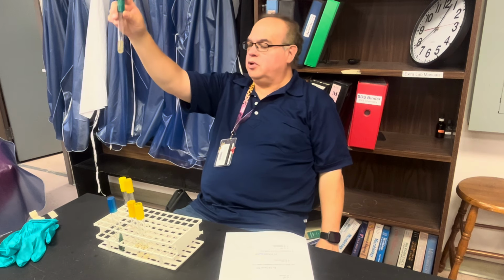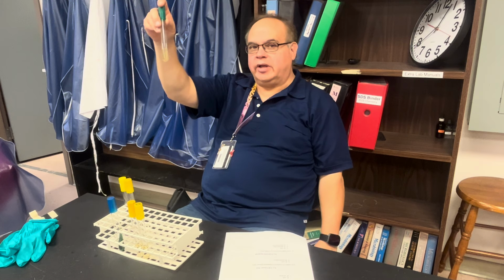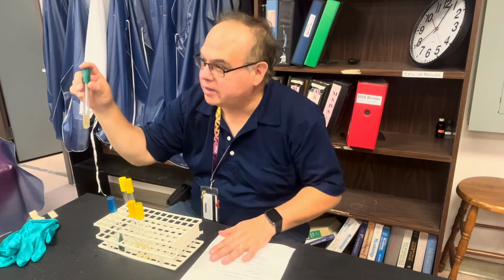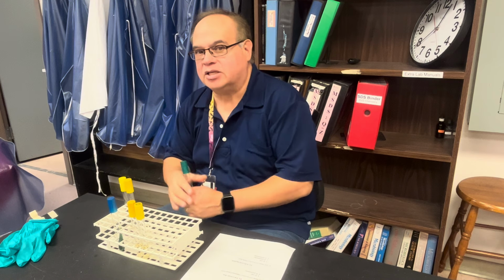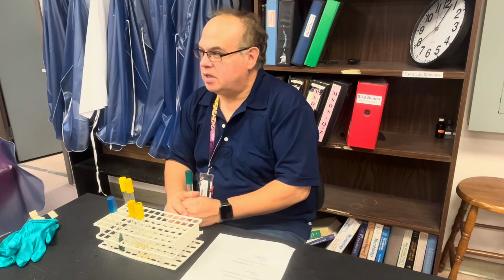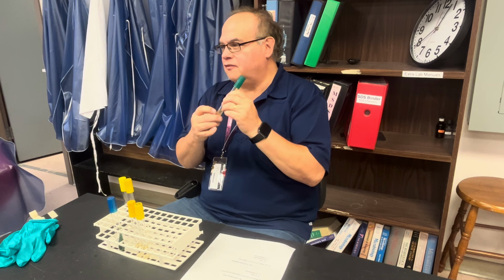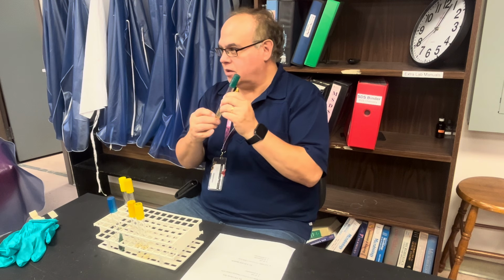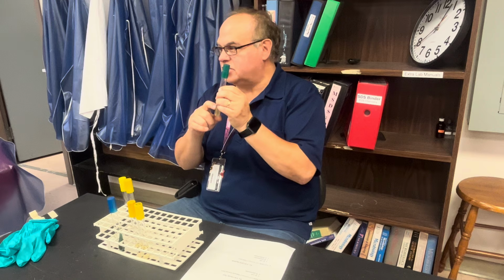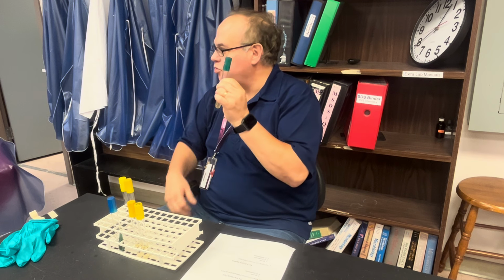There are 3 different substrates in here, 3 different test results that we're going to get. The first one is whether or not hydrogen sulfide gets produced. Hydrogen sulfide is a gas. It gets liberated when proteins are breaking down. And in here, there's a little bit of ferrous ammonium sulfate, also known as iron. That will react if hydrogen sulfide gets produced, and it'll produce a black precipitate. And the black precipitate, because it's a gas, will be throughout the entire tube.